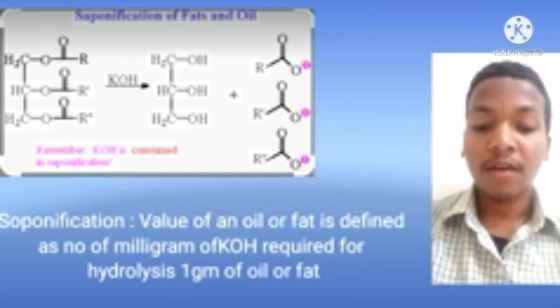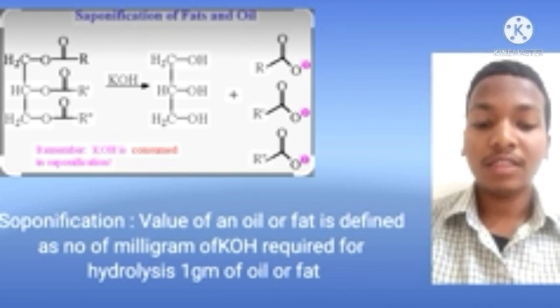Saponification value of an oil or fat is defined as the number of milligrams of KOH required for hydrolysis of 1 gram of oil or fat.